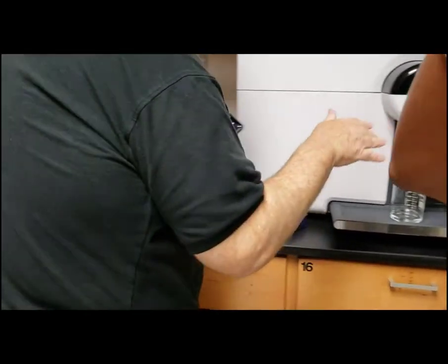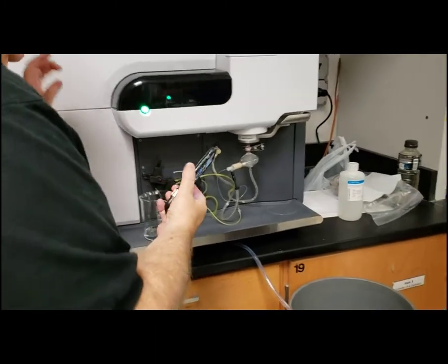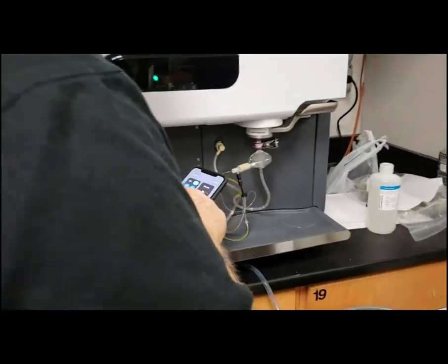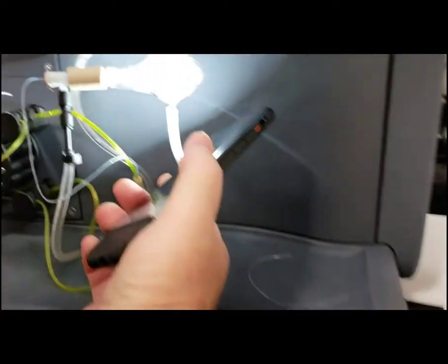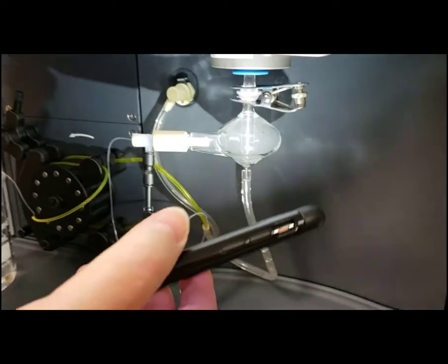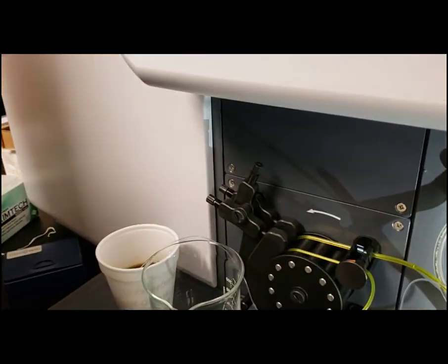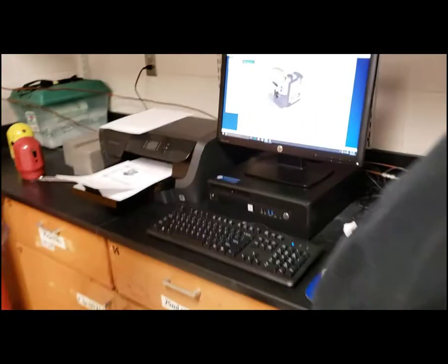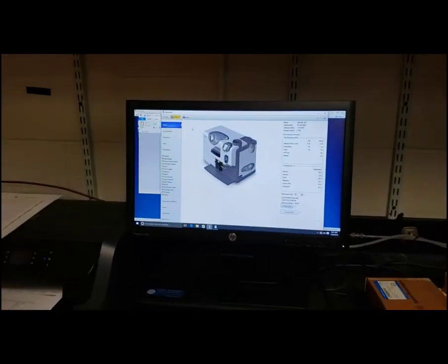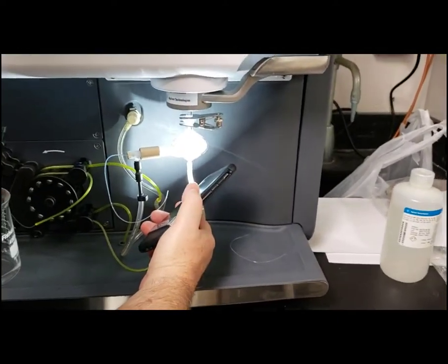It's running. You also want to look at the mist and make sure that you don't have water droplets. We have developed a little bit of water droplets on the inside, so we can go back to the coffee. We can go to fast pump. And then once the coffee comes in, we'll disperse those again.